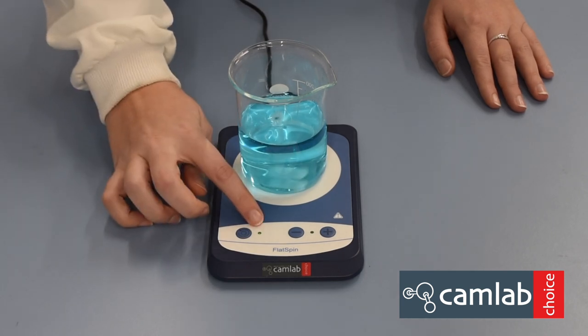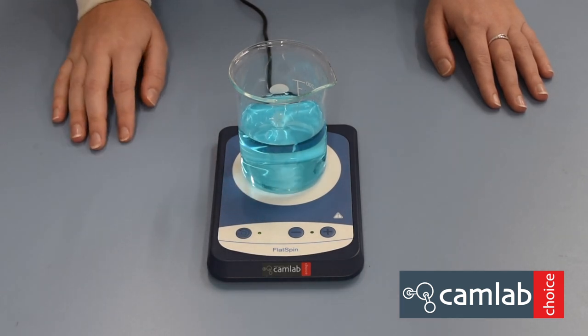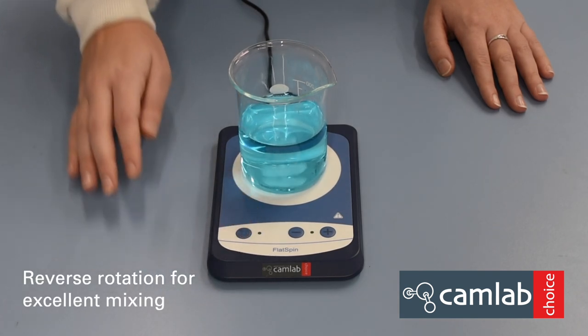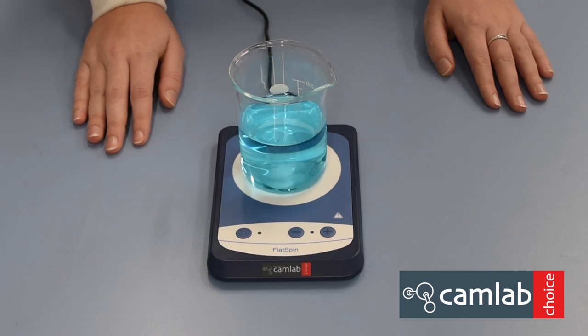When this light is constant, the steering direction will stay the same. To change to multi-directional steering, press this button. When it is flashing, the steering direction will change every 15 seconds.